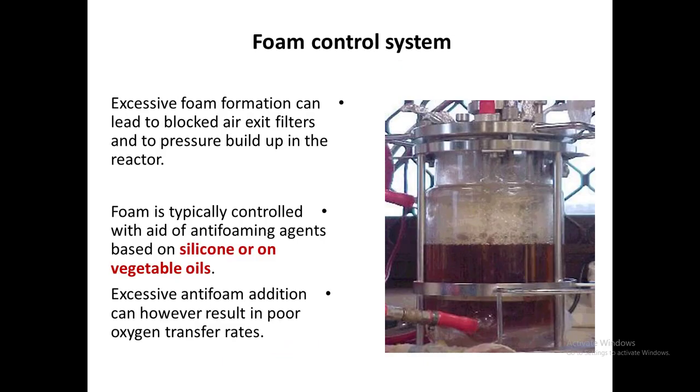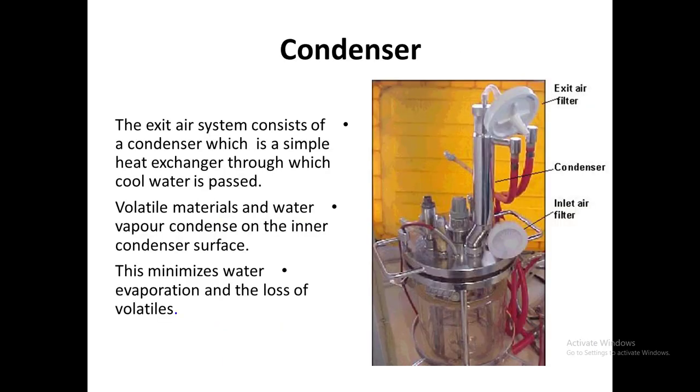Foam control system, condenser. The exit air system consists of a condenser, which is a simple heat exchanger through which cool water is passed. Volatile material and water vapor condense on the inner condenser surface. This minimizes water evaporation and loss of volatiles.